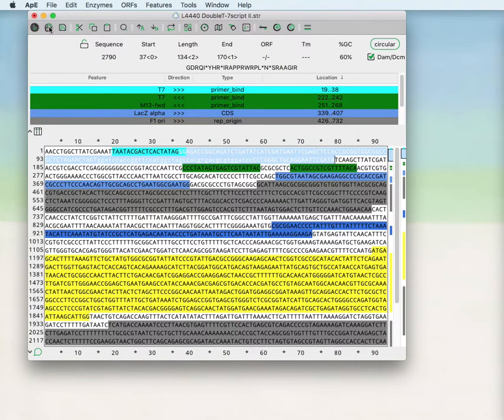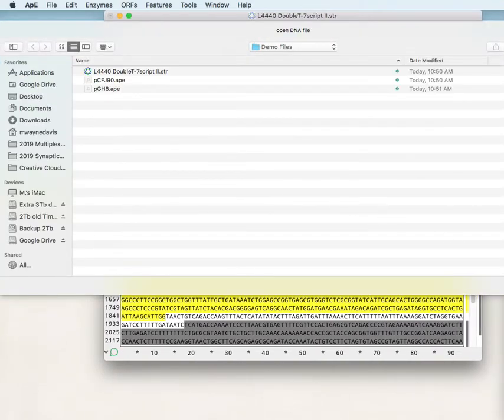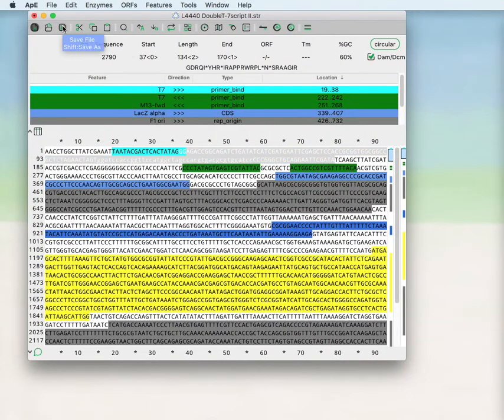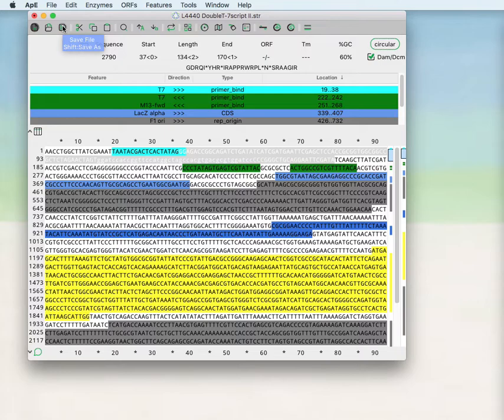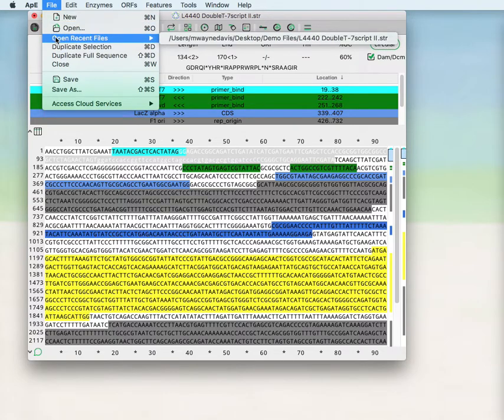You can open a file. You can save the current file or shift click to save the current file as a new file name. These functions are also available in the main menu as well as opening recently opened files.